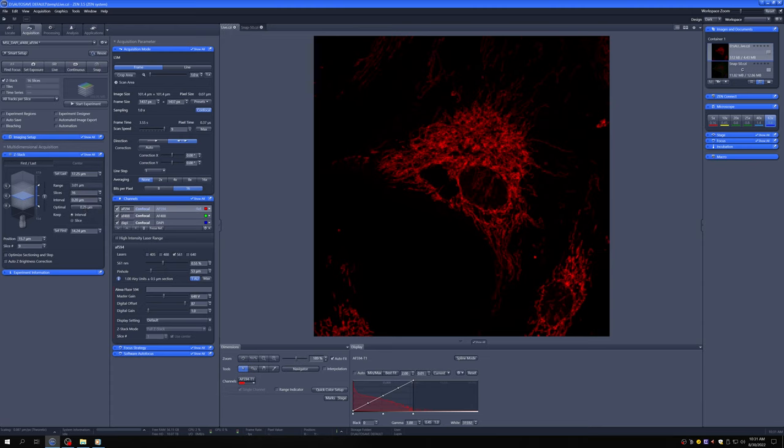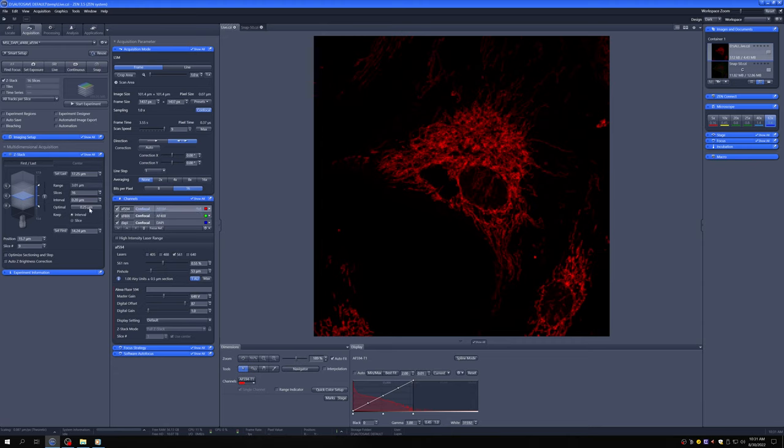Here, I would suggest that if you want the highest possible resolution, use an interval of 0.2. If you're okay with something a little bit less high resolution in the Z-dimension, you can use whatever it says in optimal. So I'm going to use 0.2 now.